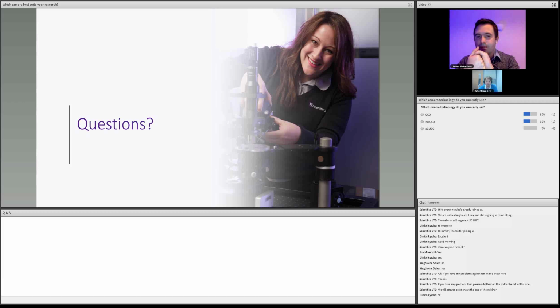If you're looking to go for 50 hertz, then your shutter normally, I can't remember off the top of my head, but they take something like 10 milliseconds. So they're not going to be able to work in that kind of time scale. In terms of the light source, it depends on if you're looking to switch channels or whether you're just illuminating with a single channel. Because at 50 hertz, you're probably not going to bother turning the light on and off very quickly.